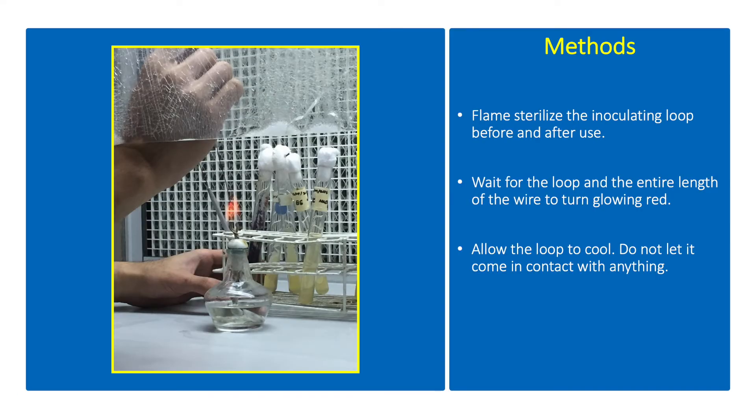Perform the transfer of inoculum inside the laminar flow hood or biosafety cabinet. Disinfect the hood with 70% ethanol. Light an alcohol lamp and place the cultures, slants, and tubes near the alcohol lamp. Use a test tube rack and do not lay the tubes on the table. Do not open the air filter when performing the transfer of inoculum inside a laminar flow hood. This might expose the researcher from airborne contaminants from the culture.